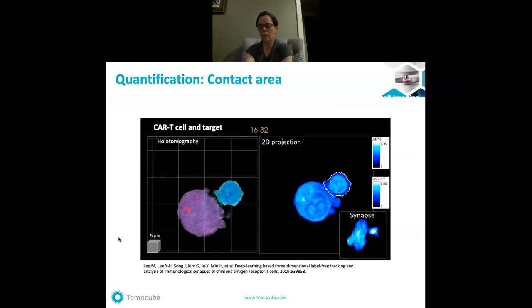The development of that framework enables high throughput automated segmentation of thousands of immune targeted cell pairs for analysis of 3D immunosynapse dynamics, something that's not been done. You can read more details about this approach and its potential application in the reference below the movie.